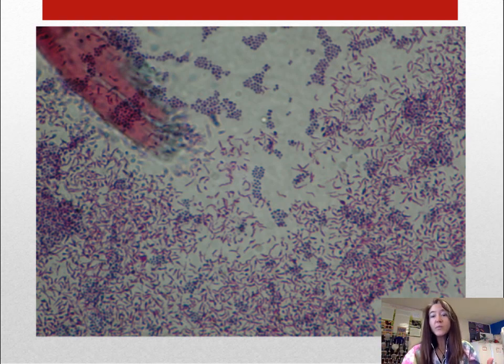So today we will perform 2 differential stains. Get jazzed, get ready, make sure you watch Virtual Edge, and be ready to rock and roll when you hit the lab door.